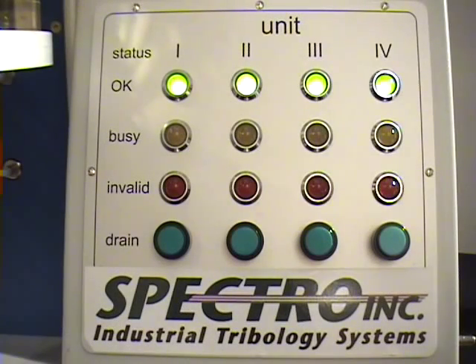The matrix of colored LEDs on the control panel gives continual visual feedback to the user, so that even from a distance, the status of all measuring tubes can be seen quickly. When the OK light is lit, the tube is ready to accept a sample. When a sample has been injected, the busy LED will illuminate as soon as the sample has passed the first optical sensor.